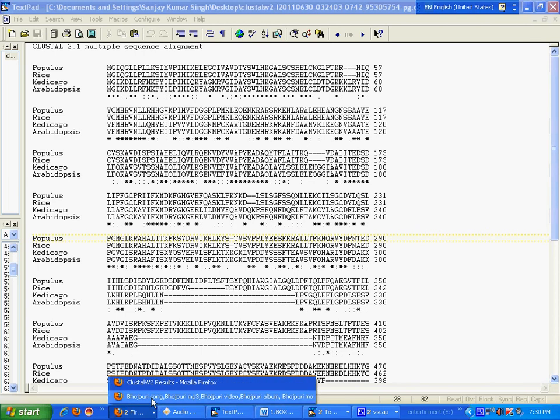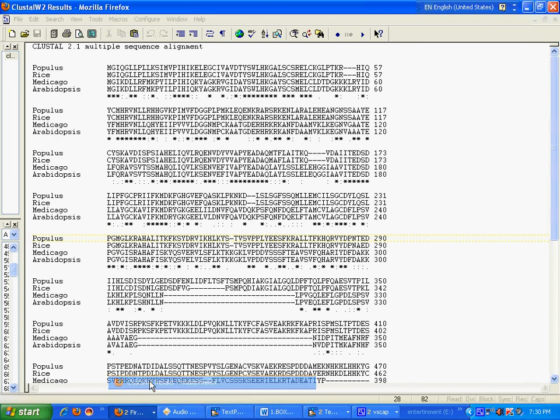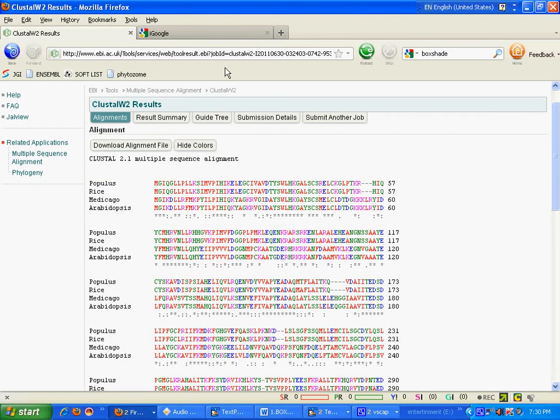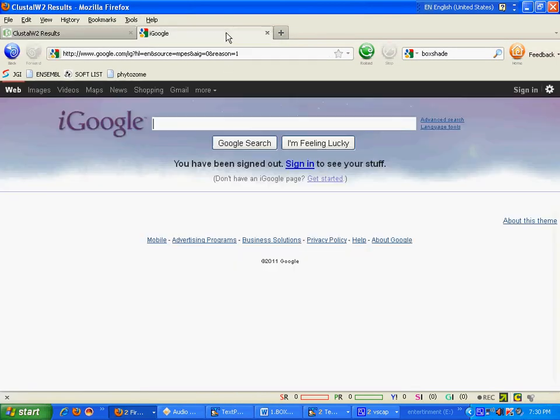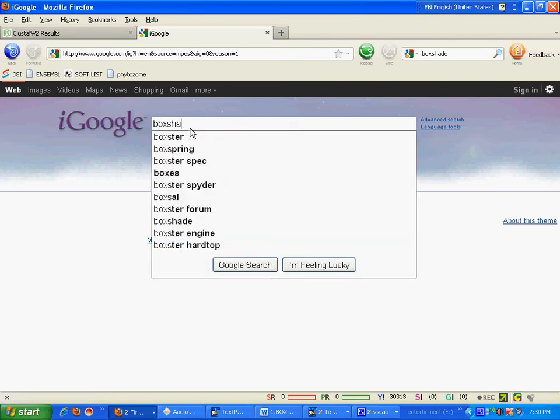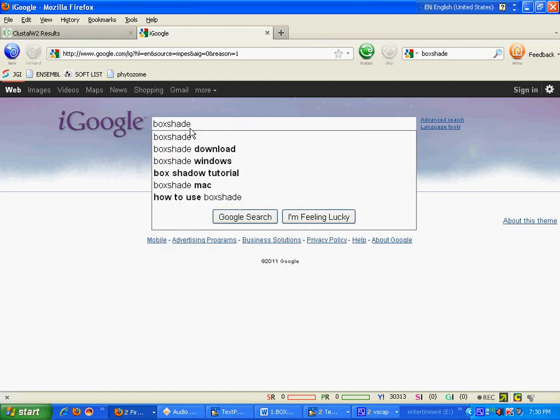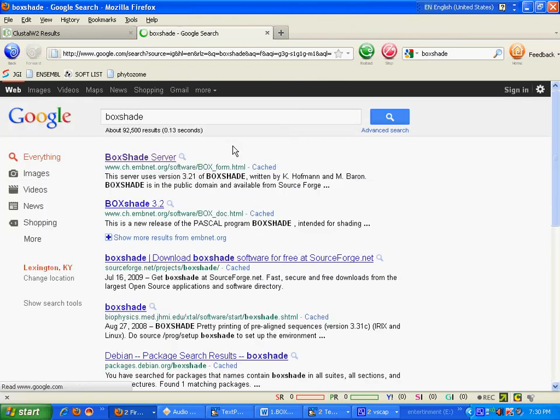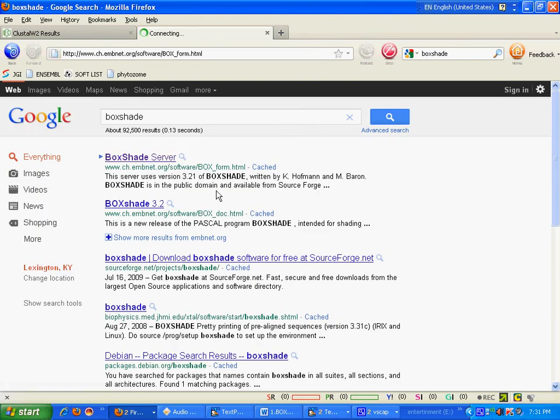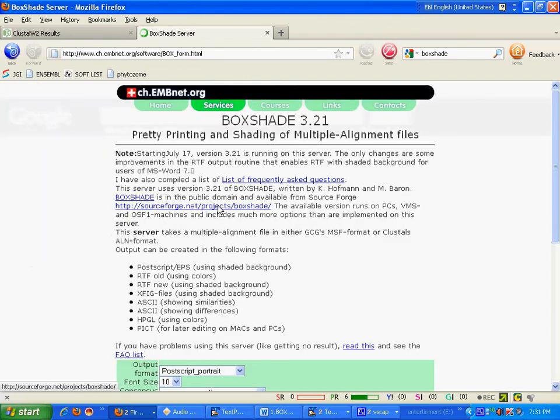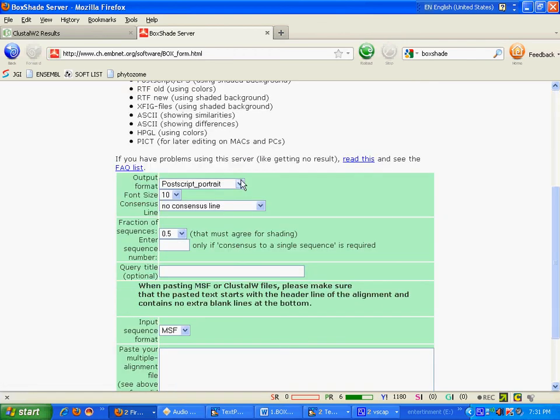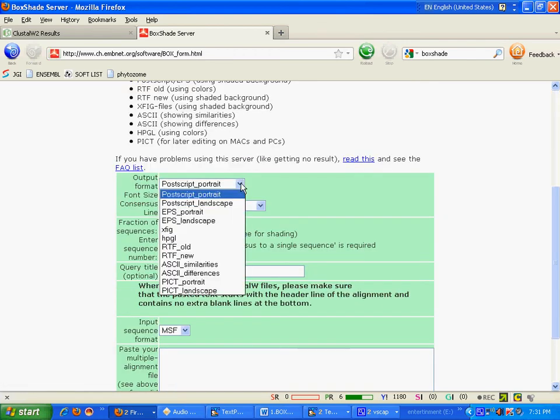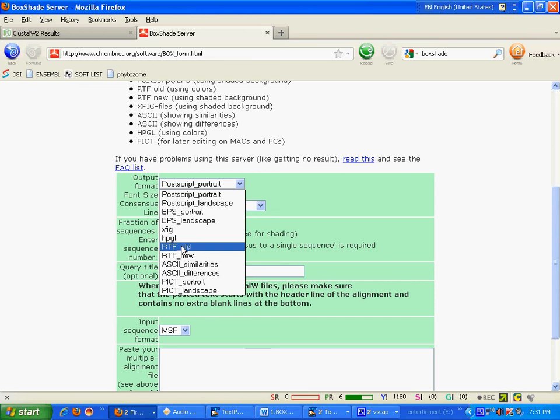To present it in some more interesting way. For this, I will search Google for BoxShade. Here on BoxShade, I will choose the RTF new. This one. Not RTF old. RTF new.